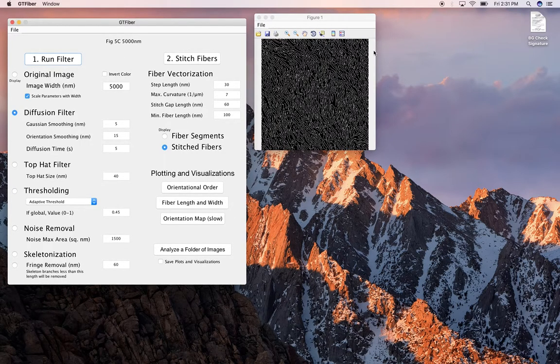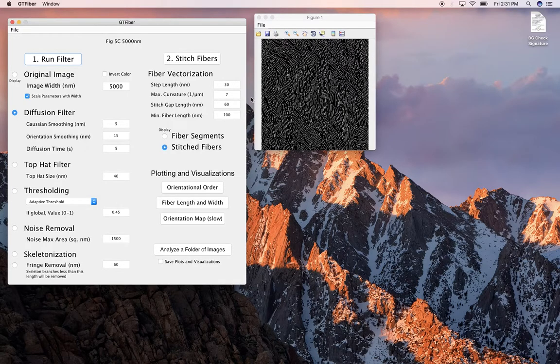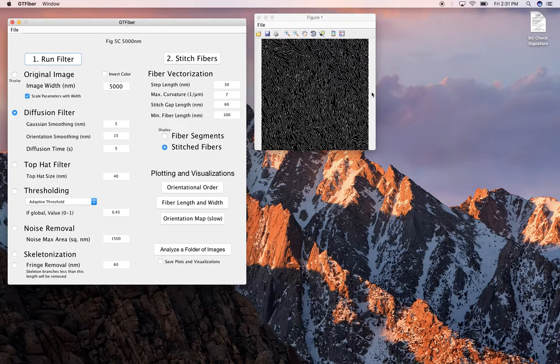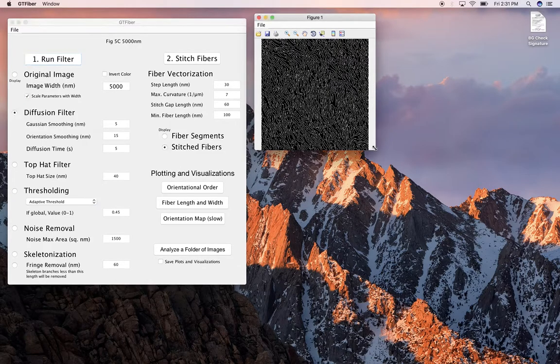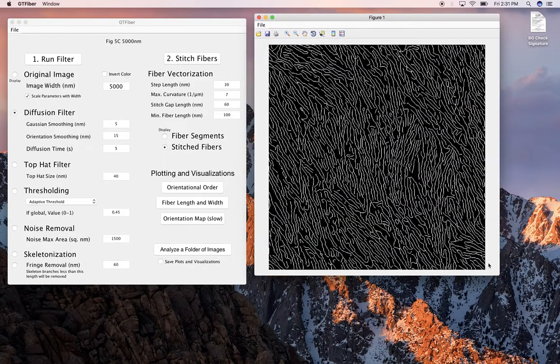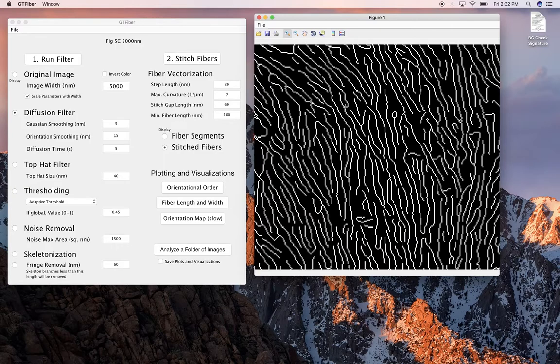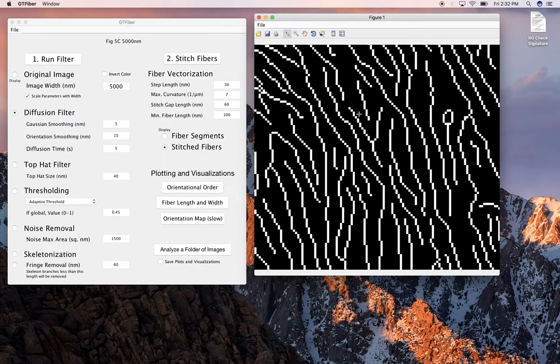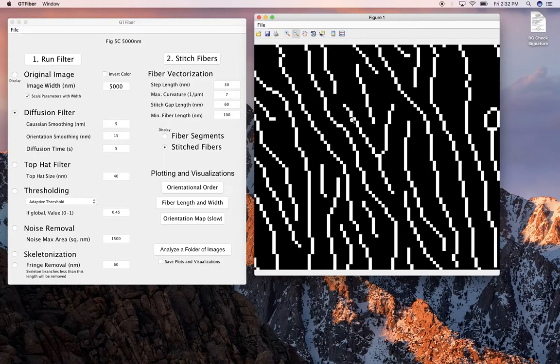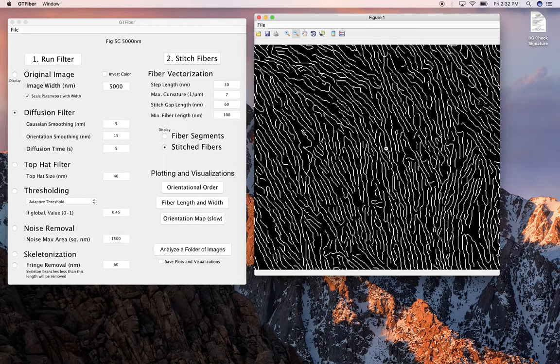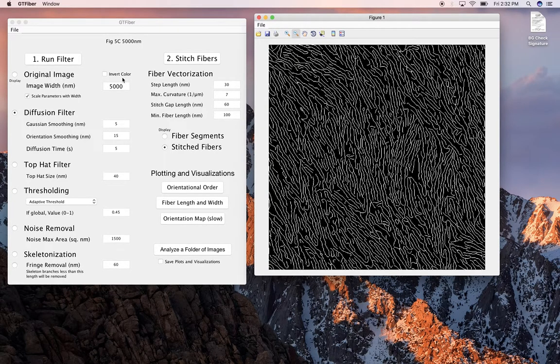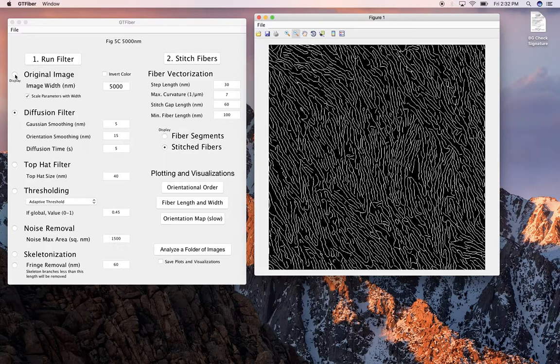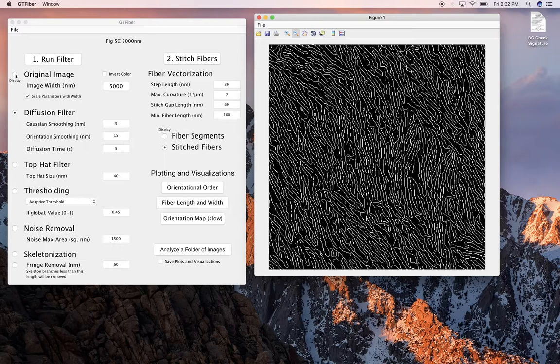So you'll see the result of each filter displayed at the end of every step, and so after running the filter, what we obtain is this image called the skeleton. And so in the skeleton, what's happened is you have these nice tools available to you that are part of the MATLAB interface. What's happened in the skeleton image is that we've thinned all the fibers down to a single pixel width, so they are exactly one pixel wide, and that's a really good way to analyze fibers.